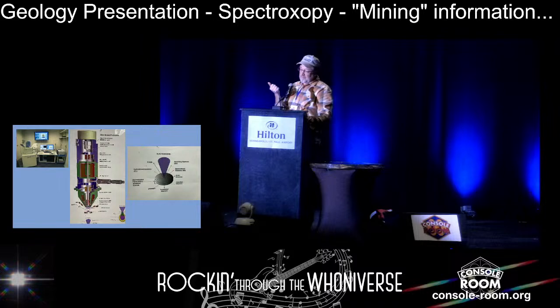We do have a cathodoluminescence detector, which we use to look at zircons, for example, and see whether they are complicated or one uniform color. That's important for geochronology and dating. But we use secondary electrons to look at the topography, and we use backscatter electrons to look at what we call atomic mass contrast and see different minerals based on brightness. And then we produce X-rays.